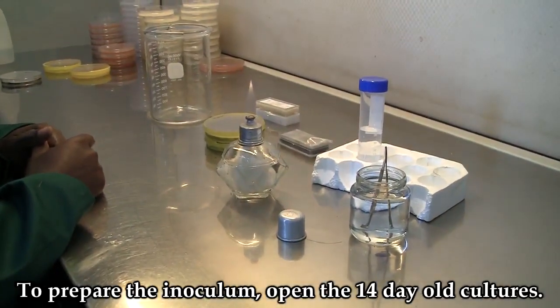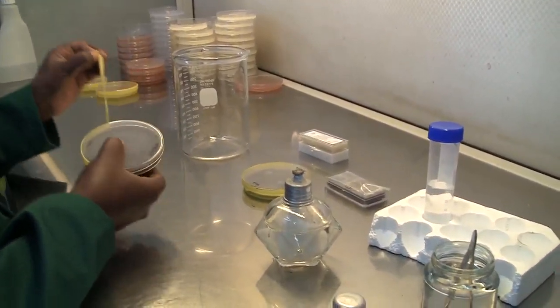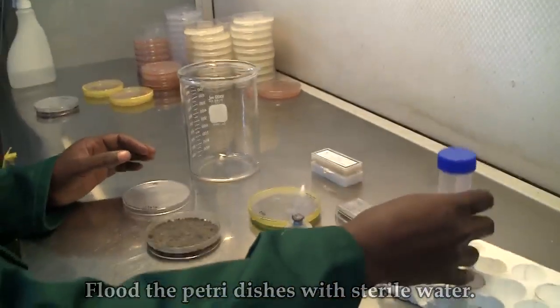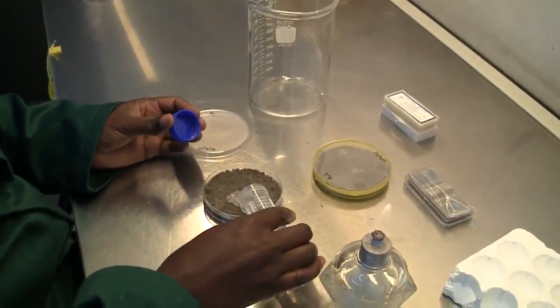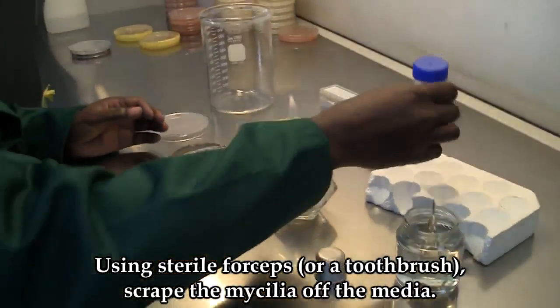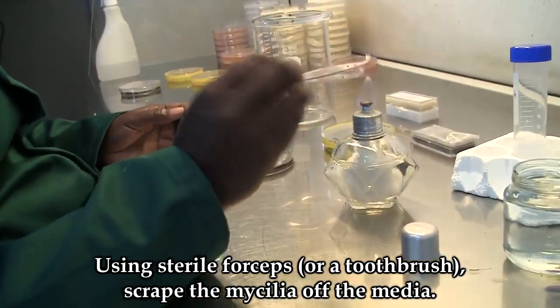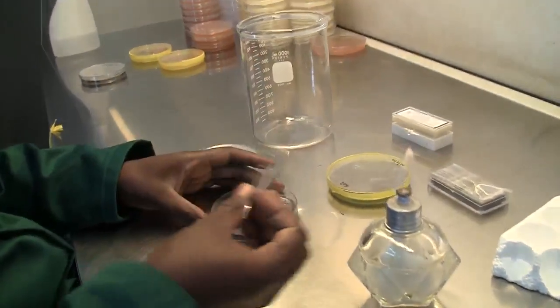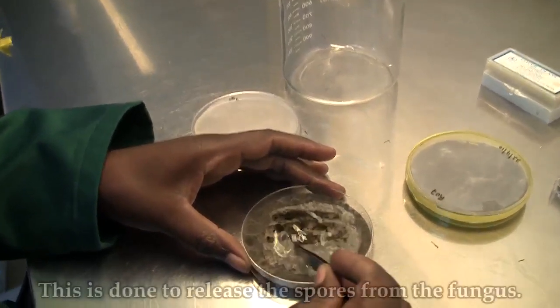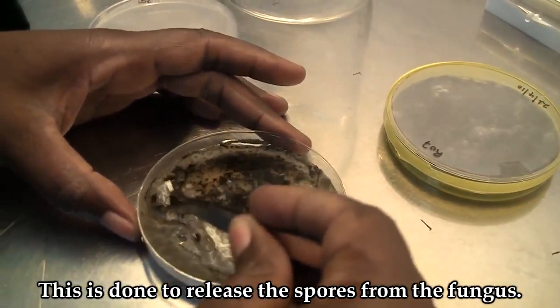To prepare the inoculum, open the 14-day-old cultures and flood them with sterile water. Using sterile forceps or a toothbrush, scrape the mycelia off the media. This is to release the spores of the fungus.